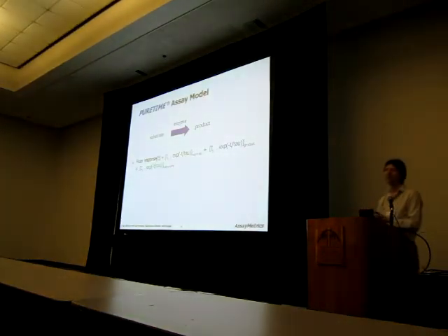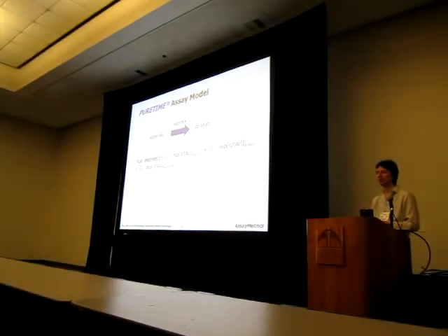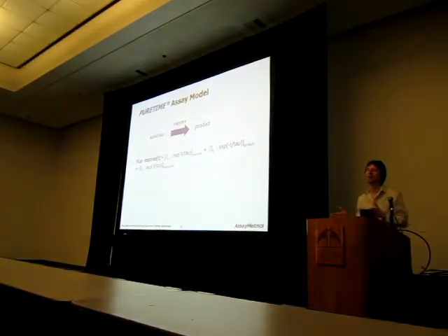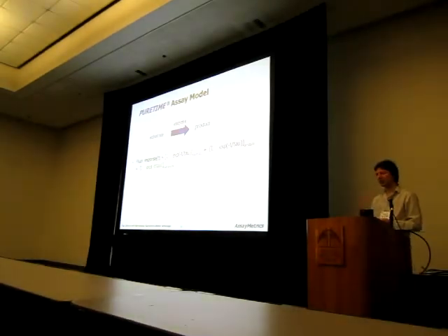So this is the main difference, I think, between doing conventional time-resolved FRET and doing genuine fluorescence lifetime: the period over which you measure the fluorescence intensity. You make no assumptions that after 60 microseconds or 60 milliseconds, all of your competing fluorescence has disappeared. With a fluorescence lifetime assay, you measure it all the time, and then you attempt to correct for it.